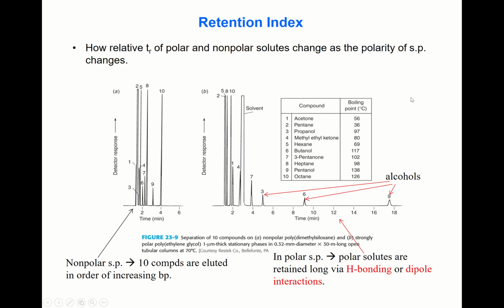Next topic is the retention index. It tells how the relative retention times of polar and non-polar solutes change as the polarity of the stationary phase changes. Okay, let's look at these two chromatograms.